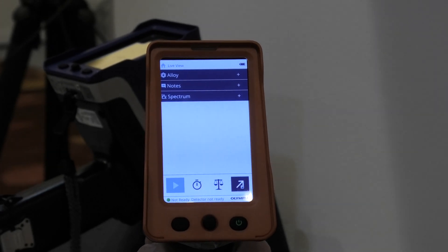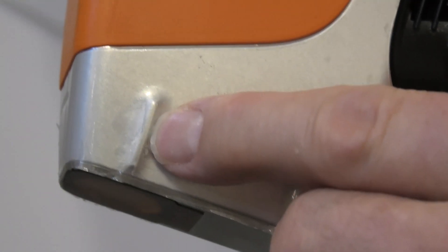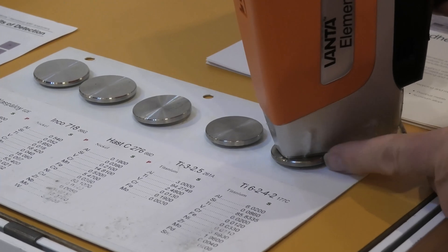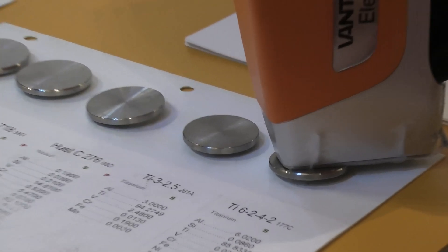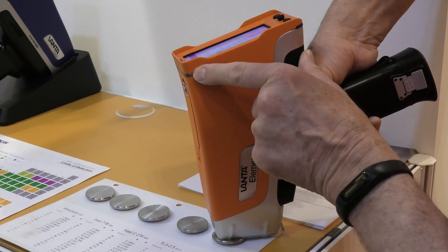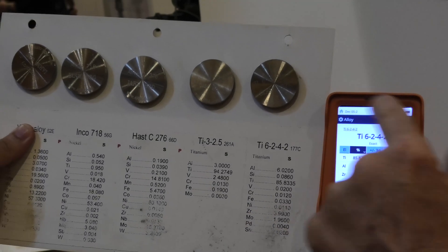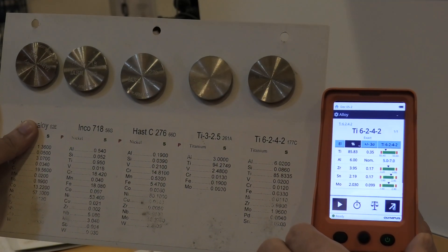The instrument is now ready to use. We line the sample up with this line here. I've got a test sample here. I'm going to pull the trigger, and when the instrument starts it's emitting radiation — there's a flashing light. And when that stops, there's the result. That's the test sample. It's that simple to use.